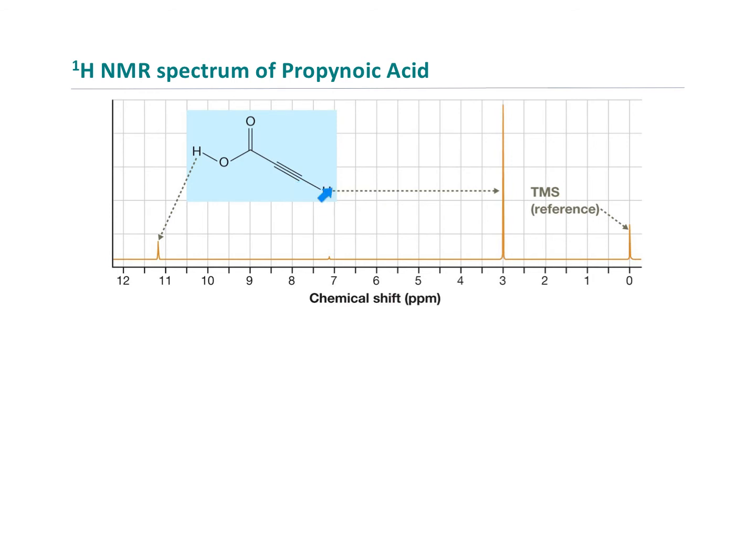There's only 1 proton attached to this carbon and only 1 proton attached to that alcohol. Those are going to be different chemical environments, okay? This is the way I learn. This is the way I do it when I personally work these problems. But your book uses a different method, and so we'll talk more about the method that I prefer versus your book in class. But you may work better with the book method, and so I don't want to discount that.